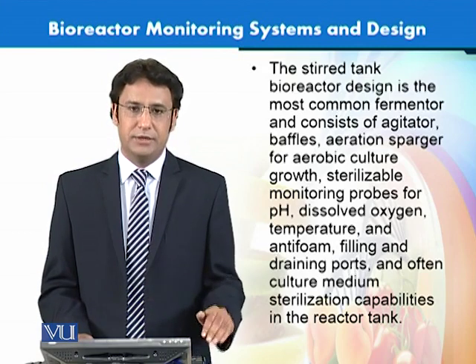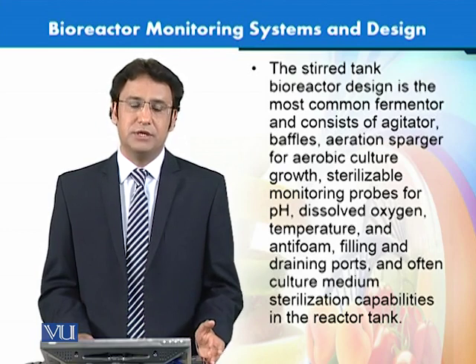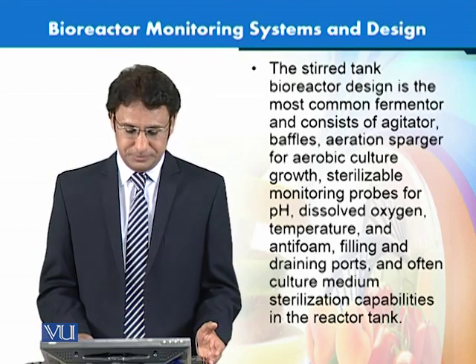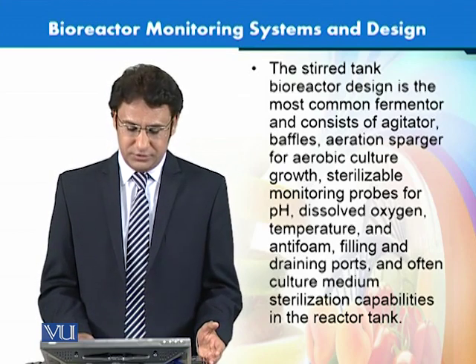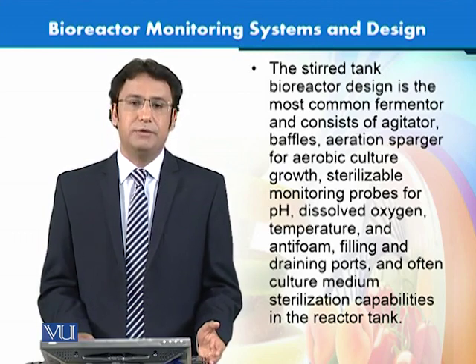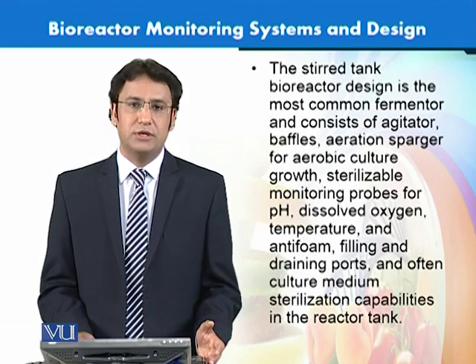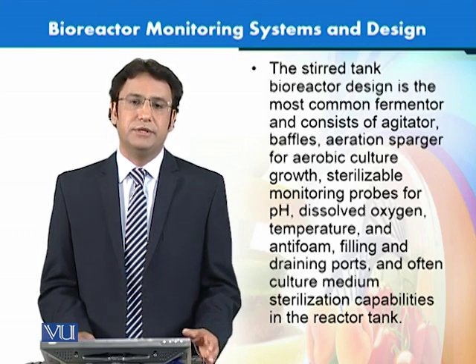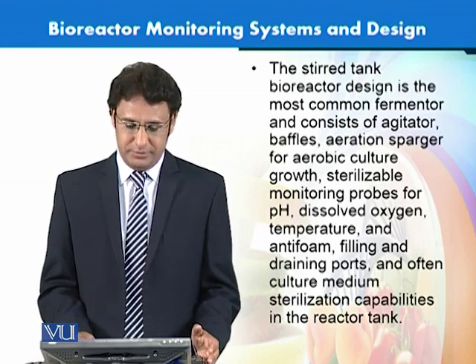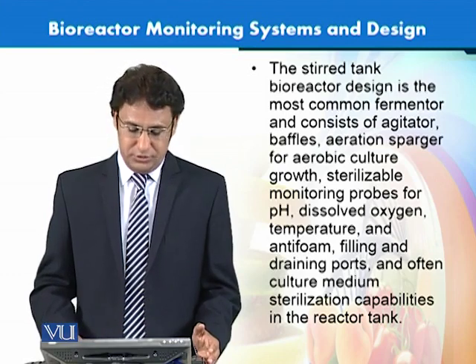The probes give you information about the substrate, and they should be able to be sterilized, because if they are not sterilized, they can be a source of contamination. Similarly, dissolved oxygen, temperature, and foam, anti-foam, filling systems, and draining ports. These are all the component parts of a fermenter, especially the stirred tank bioreactor type. As I said, this is very commonly used.